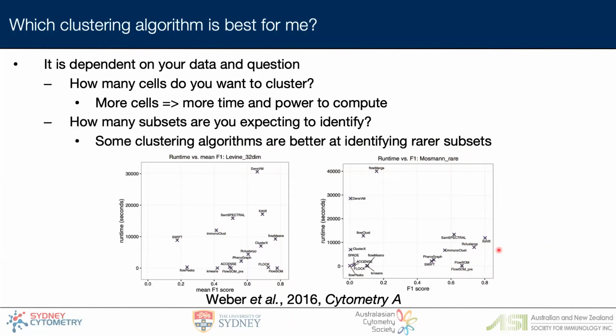You've heard us ramble on a lot about FlowSOM, and we do generally use this the most compared to the others. And for me personally, I use it for the speed of it. And like any clustering algorithm, the assumption I have is that the clustering is not perfect. So as long as you realize that none of these are strictly bad to use, it's just that there are some that are more appropriate than others. And I'll show some examples of how I've used FlowSOM a bit later on.